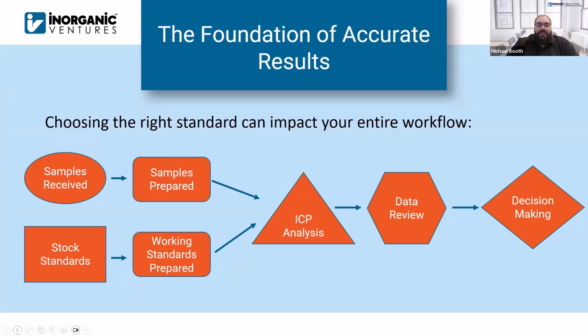Your stock standards are usually where you're starting out. Typically, folks are preparing those to make some sort of working standards. At the same time, you're getting in your samples and have to prepare those. Then it goes through the ICP analysis. And then hopefully you're spending the majority of your time on the data review and the decision making process based on that data review.